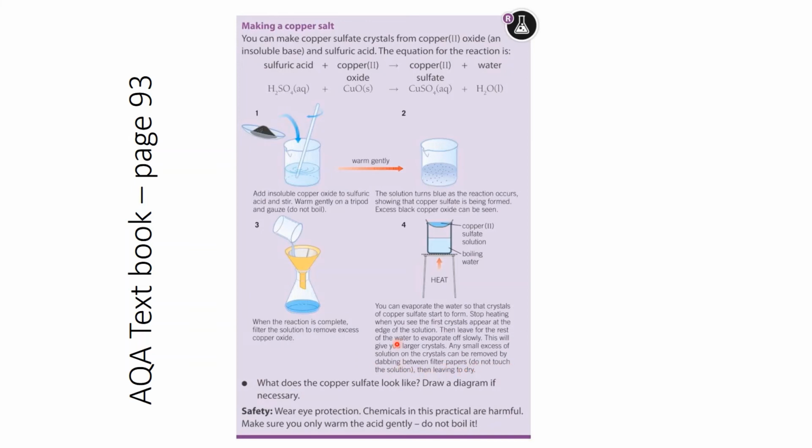If you haven't already drawn nice diagrams of these to show each stage, please do so. You can refer back to the previous slides by rewinding the video if necessary. These diagrams are fine, but my diagrams are better because they're in 2 dimensions, as they all should be, like that's shown in step 4 here. So please pause the video and go back if you haven't already drawn beautiful diagrams to help you to understand this practical.